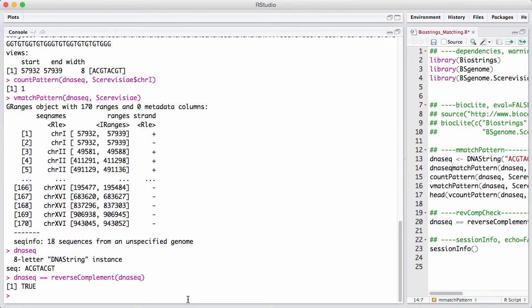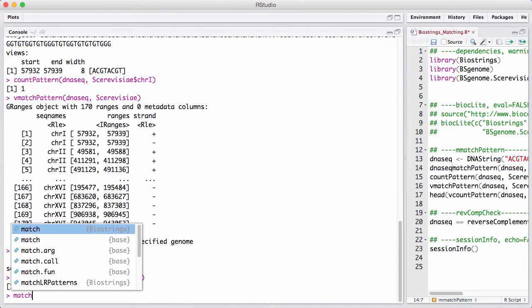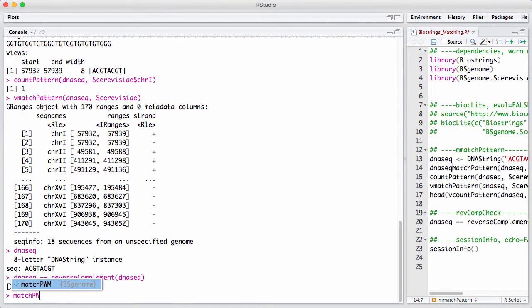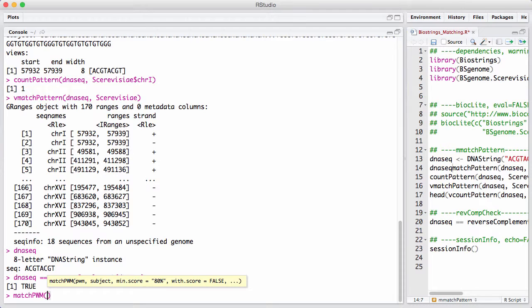There's another set of matching procedures in BioConductor that are a little bit more esoteric, but can be very useful when you need it. There's something called matchPwm, or position weight matrix.